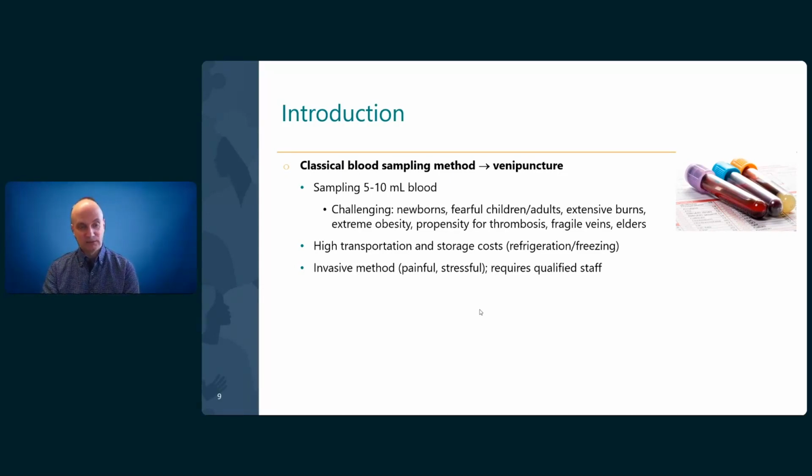But we also have to mention the high transport and storage cost, because those samples must be refrigerated or even kept frozen until the analysis. So this requires, let's say, dedicated instrumentation like fridges and freezers. But it's also an invasive method. We all know it's not easy to get a venipuncture on ourselves. So it's painful, it's stressful, and also it requires qualified staff.